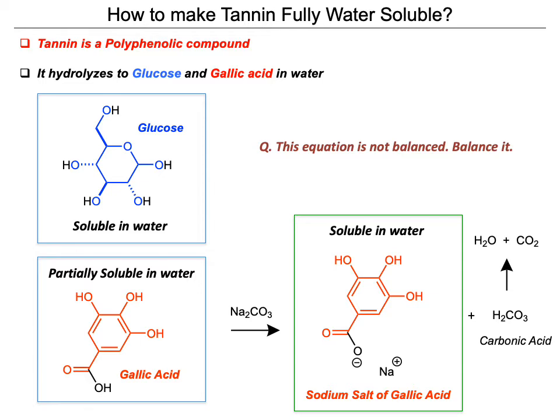This reaction is meant to separate tannin from caffeine. We want to make sure that tannin stays in the water phase, so that in the future when we have the DCM inside the funnel, we have all the caffeine inside the DCM.